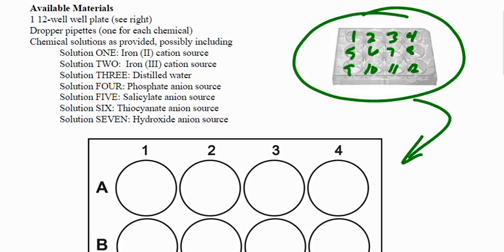So if you don't remember what dropper it is, it's not a big deal. I have plenty of pipettes. We can just put them in there as we need to, but we do not want to mix them up. Right? The solutions that you have.